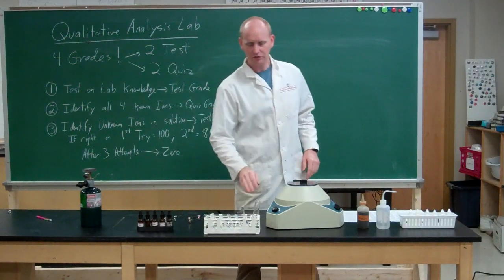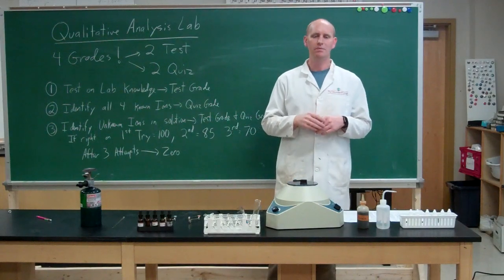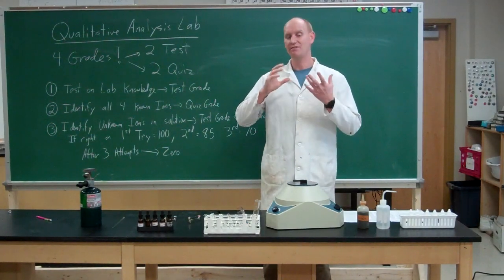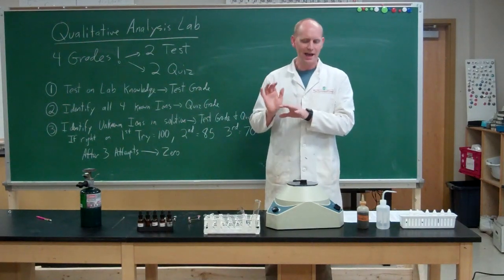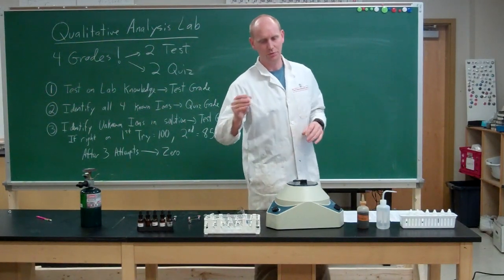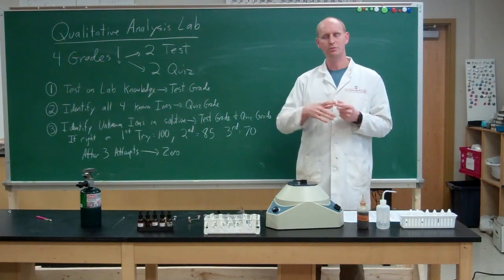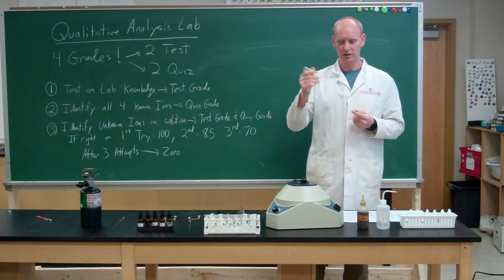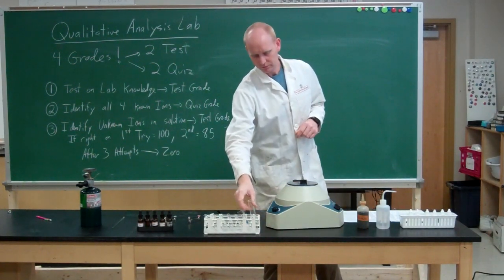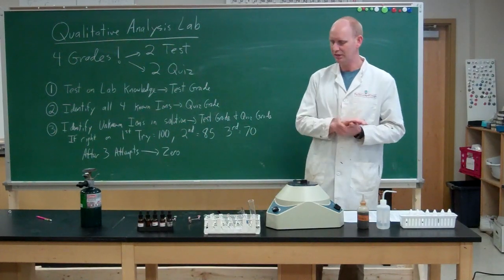Now, the small test tubes, we're going to say 5 or 6. You're going to get a cup or a beaker. You're going to label it. It's going to have your name on it. And they'll be yours, so you kind of know what you have. Now, there's also some big test tubes. These are kind of communal, so if you grab a big test tube, wash it out, but you're not going to keep it because we don't have enough to give every kid one of these. Now, there will be test tube racks around the room. You'll just grab one when you need it.